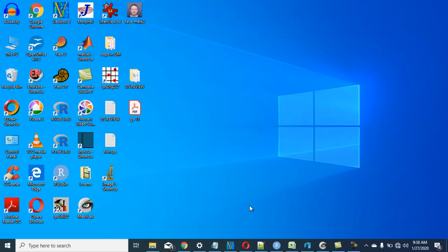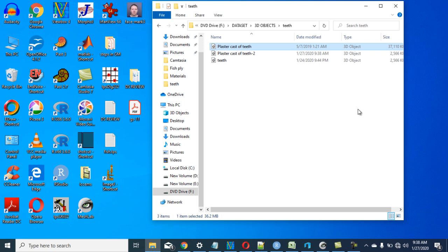Then if you go back now to this file, you can see the difference. Look at it now. You see what we do here. This is 37 MB. The second one is 2.5 megabytes, I mean 2 megabytes rather. So you can see the difference. So you can work with this now very easily. If you have 100 of this, it will be okay.